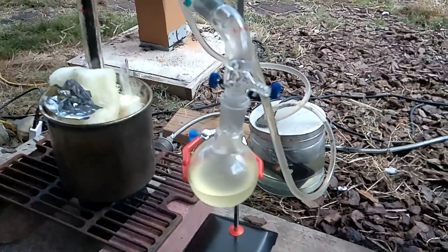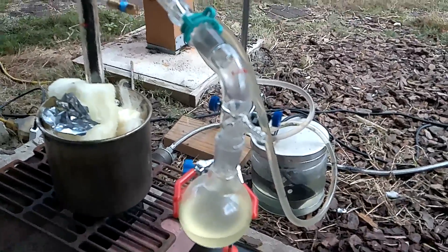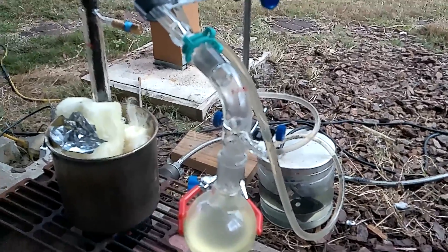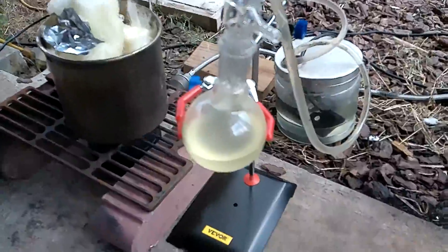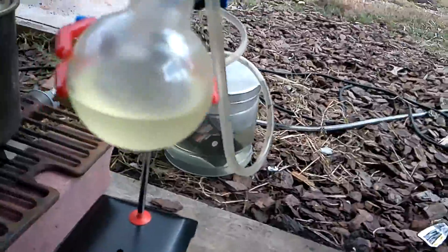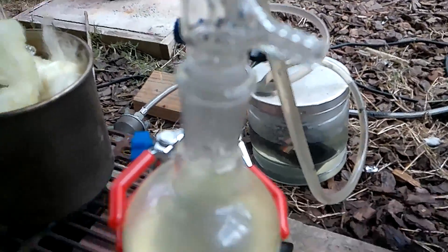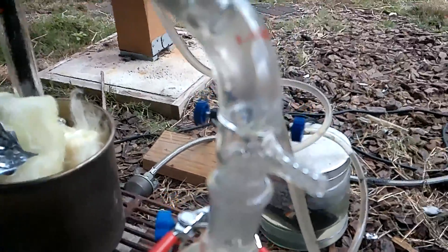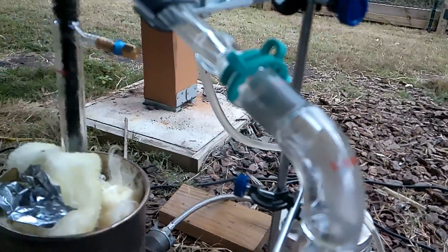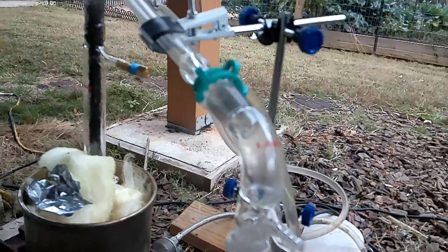I bumped up the temperature too quickly and it ended up making the product foggy — that means the separation was poor because it was kind of forcing the stuff over. We have it under control now. The quality, the pristine look is not the same; however, it still looks better than the crap before. I'm glad we got it back under control. Right now it went from 100 Celsius back down to 80 Celsius, so I need to bump up the heat just a little bit and then let it sit.